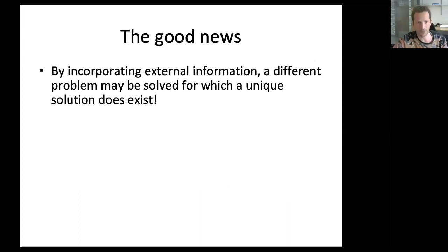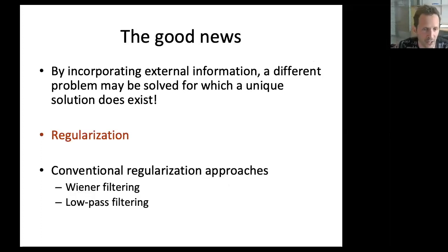Now, there is good news too, because if you can incorporate external information that you have about cryo reconstructions in addition to the experimental data, then you can express the reconstruction slightly differently into a problem for which a unique solution does exist. And that in general is called regularization. Conventionally in the field before, say, 2012, people would regularize their cryo-EM reconstructions in ad hoc manners. People would put low pass filters on them, or they had all kinds of ad hoc Wiener type filtering approaches.